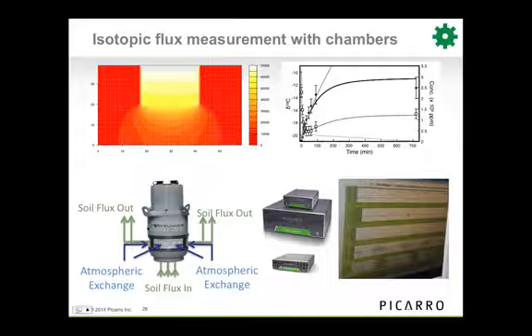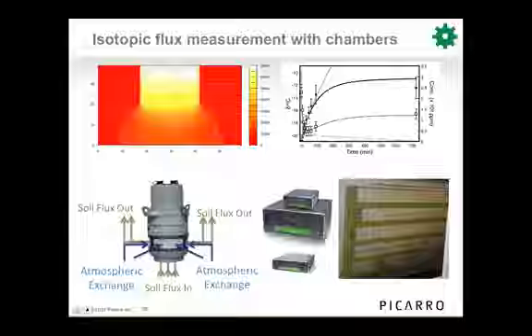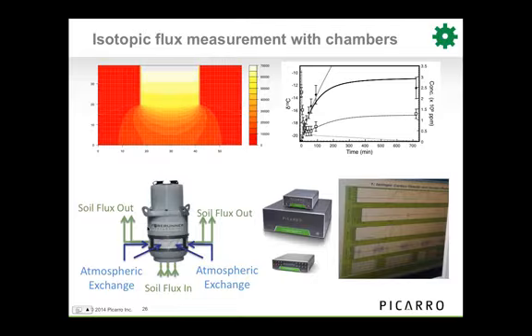So obviously this thing, when it's left on the ground, does create a microenvironment, and we want to move the chamber every so often, maybe once every month or something like that. But in general, for the short term, that small footprint allows us to keep most of that microenvironmental effect out of there.